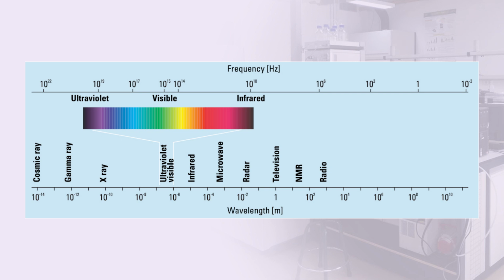So this electromagnetic spectrum will give us an idea of spectroscopy, in the sense of which radiation is falling on the material and what kind of changes will happen in the material. I will repeat: if infrared radiations are there, molecules will vibrate. If UV and visible is there, the electrons in the atoms will go up. So UV visible is at the atomic level, IR is at the molecular level, and X-rays are even within the atom at the electron level.